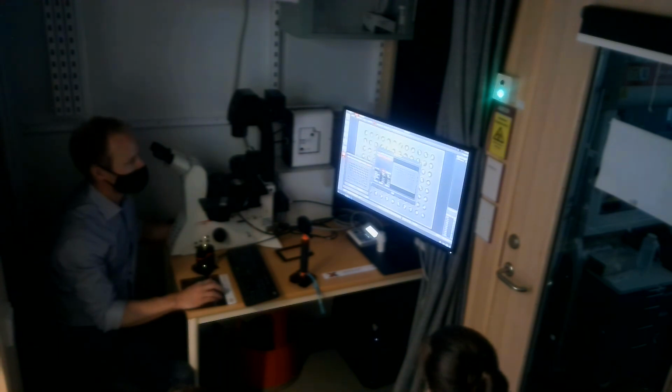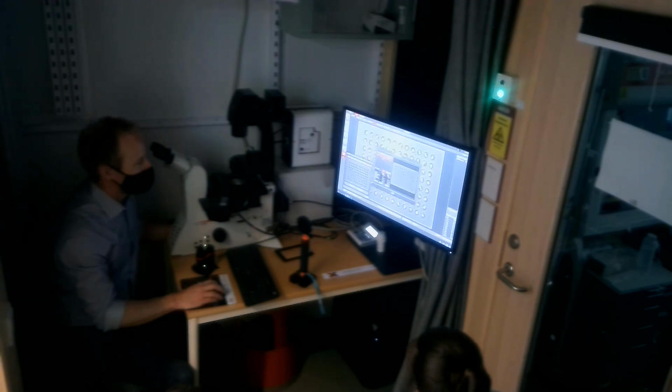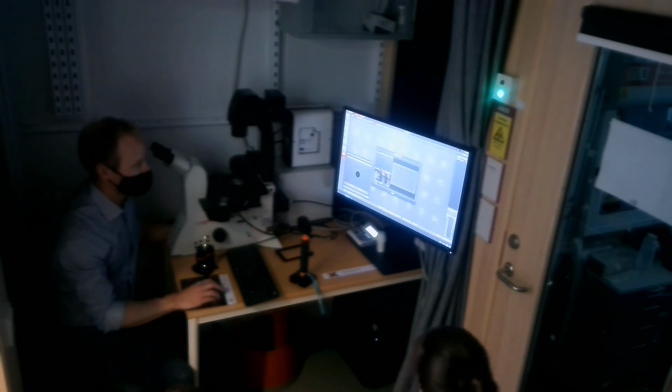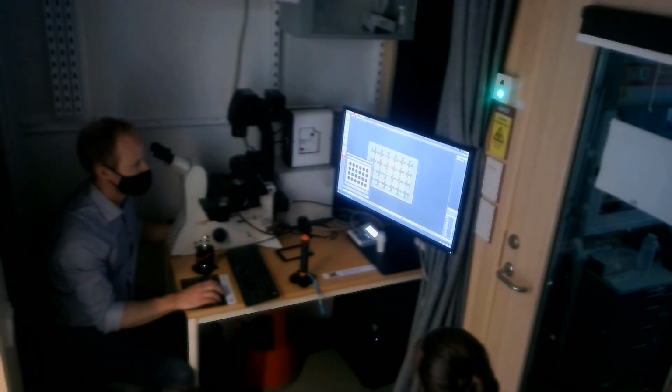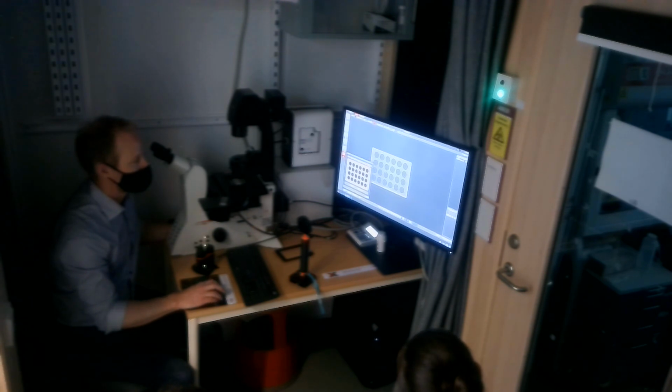So then that will be available over here. So I'm gonna close this now. Go to well plates. You have the temp here, so I can pick that one. And of course, once you don't want it anymore, you can remove it just like that. All right, and you also, of course, 24. Let me remove all of these. Yeah. So that's fairly straightforward.